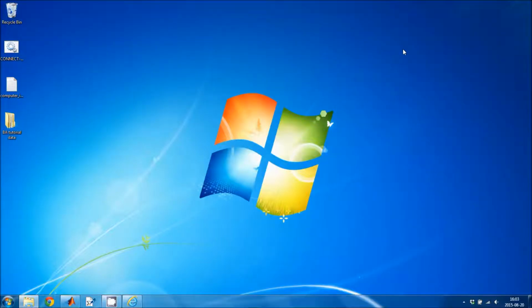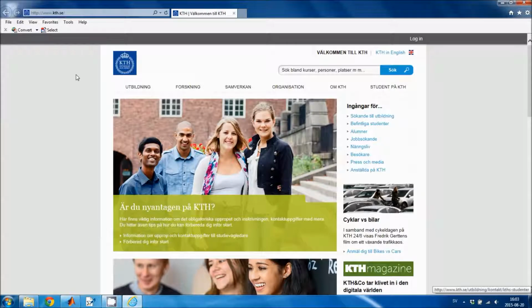This is a tutorial about how to install and run the Baxter algorithms. First, I will tell you how to download the software. You go to tinyurl.com/ba-alpha.